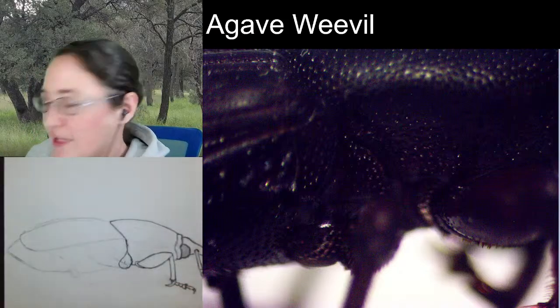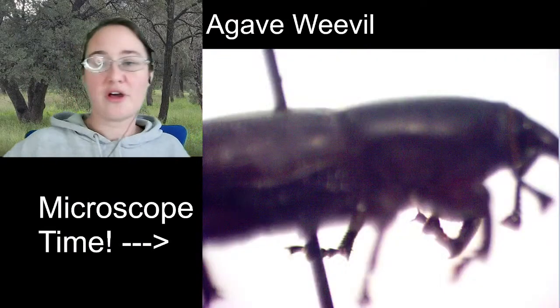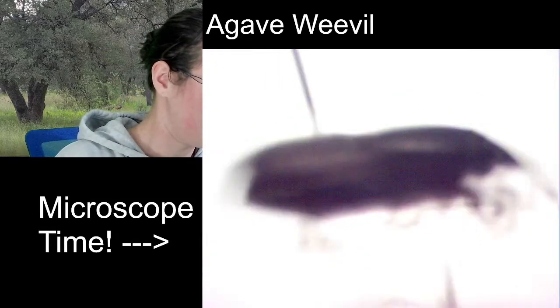Let's finish the abdomen, and then we'll come back to the middle and hind legs. Well, the elytra and the abdomen. Let's finish the body.